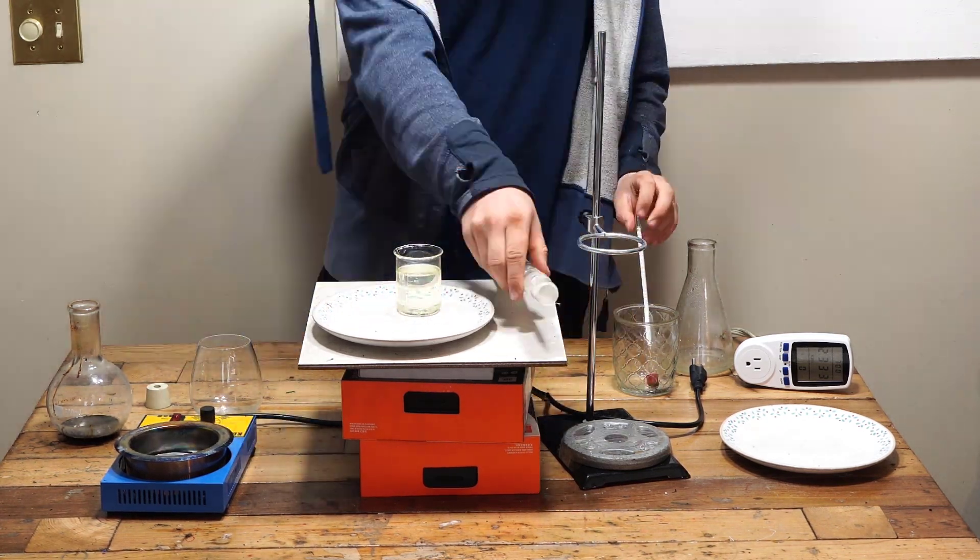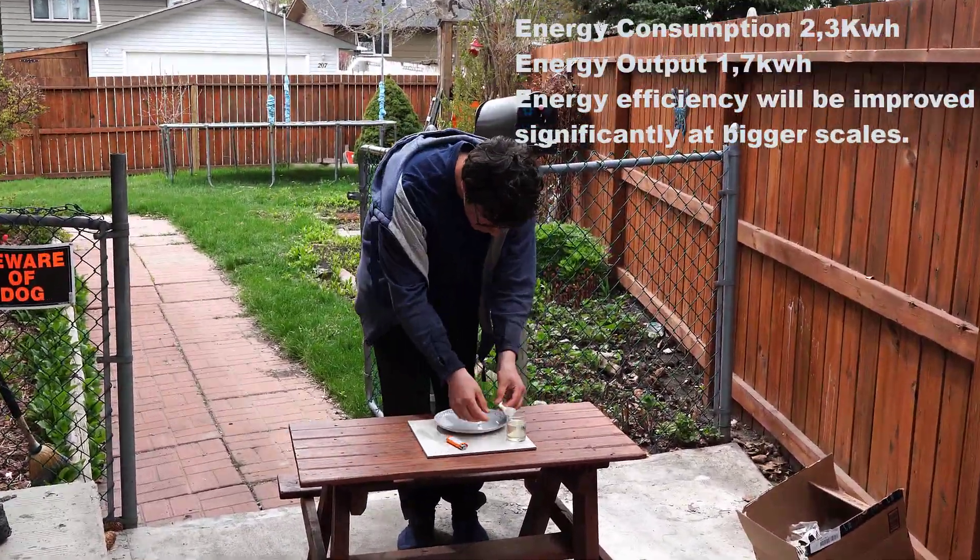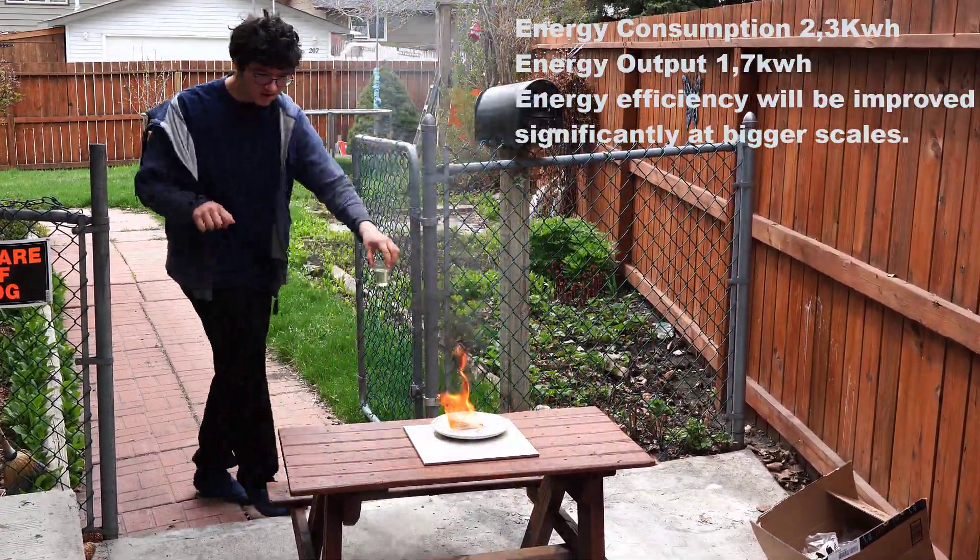Now we're going to test the flammability of this substance — and yes, it burns.